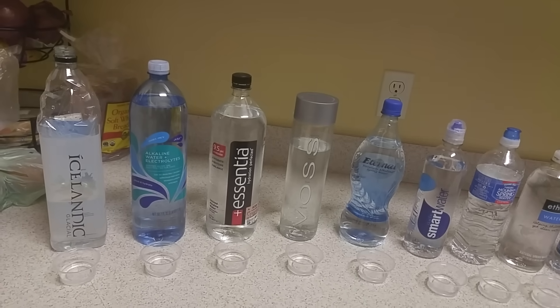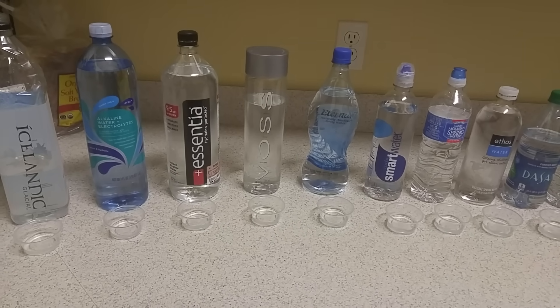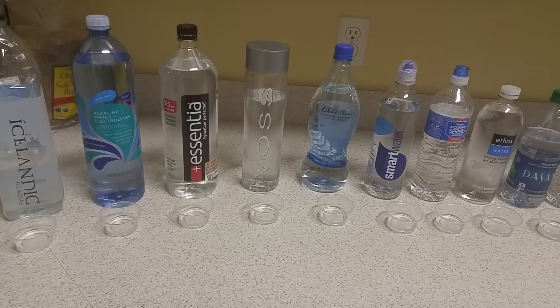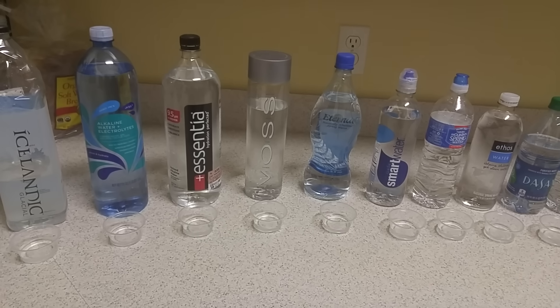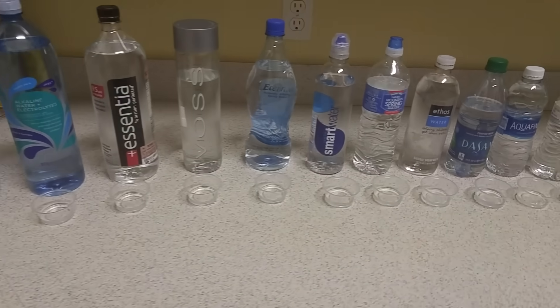We have some pH drops that we're going to use — about three drops in each sample. The darker blue or purple it is, the higher the pH level. A green which is 7 is neutral and that's where it should be at. Anything less than that — if it turns out orange or yellowish — that's not good and it means the water is acidic.